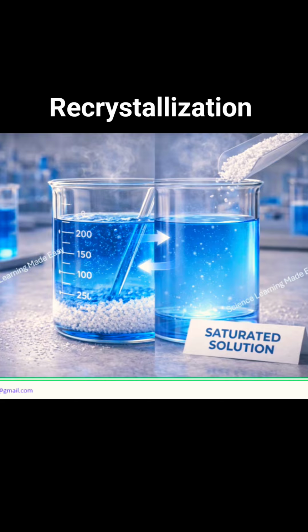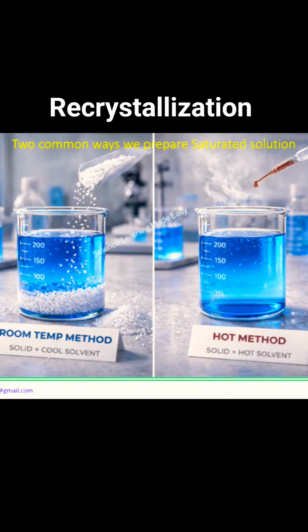Understanding this limit is vital because, in recrystallization, we are going to manipulate this fullness to force our desired substance out of the liquid and into a pure solid form. There are two primary ways we prepare this.